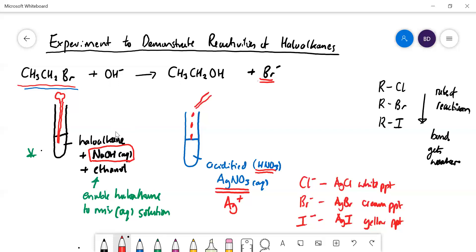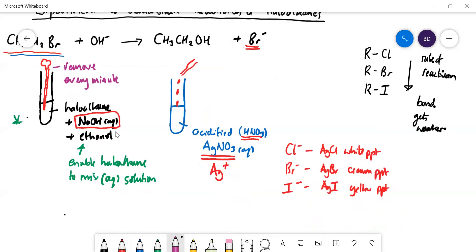So you're testing to see how long it takes for a precipitate to form. You're going to remove drops every minute and time how long it takes for a precipitate to form. Which one should form the precipitate most quickly? It should be the silver iodide because that undergoes nucleophilic substitution the most quickly.